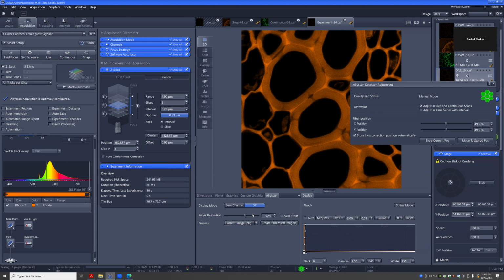I would say starting out, leave this auto filter on, but if you want to very consistently process every image exactly the same, you want to match this value right here, the number that you pick. Again, this depends on your sample. Say you do 5 or 6 Z stacks at like 4.4, 4.5, 4.6, you might pick a middle value. But as a starting point, auto filter is totally fine. If you're doing quantifications of intensity, there you want to have the exact same treatment. If you're just looking at structure, auto filter is totally fine.